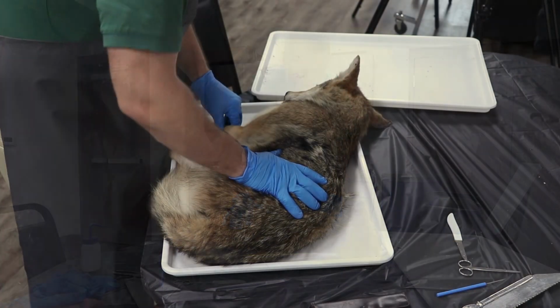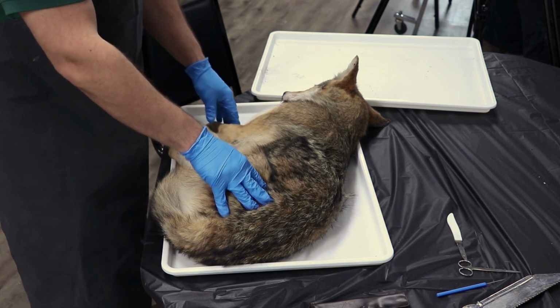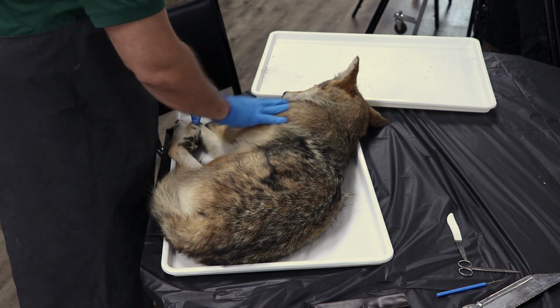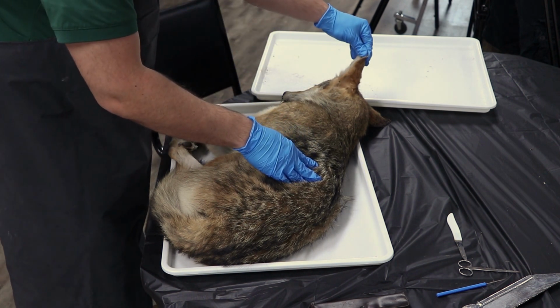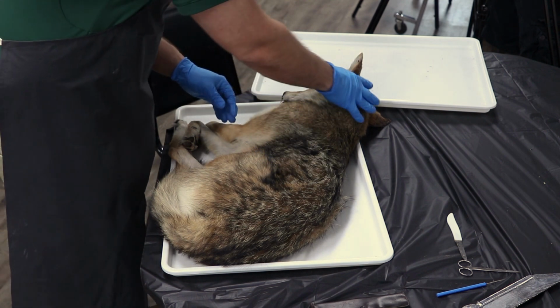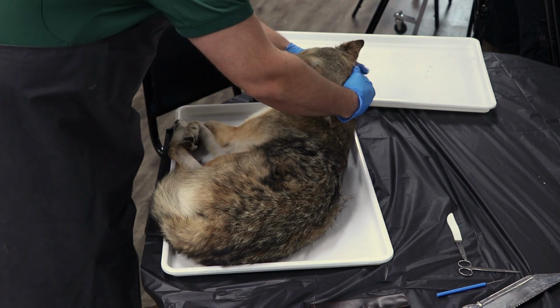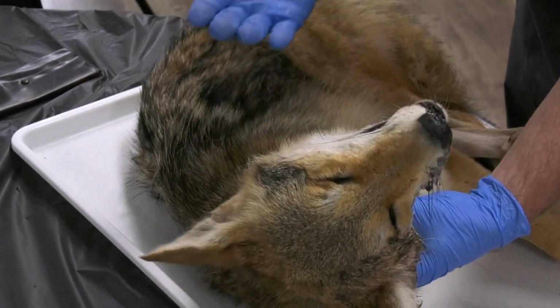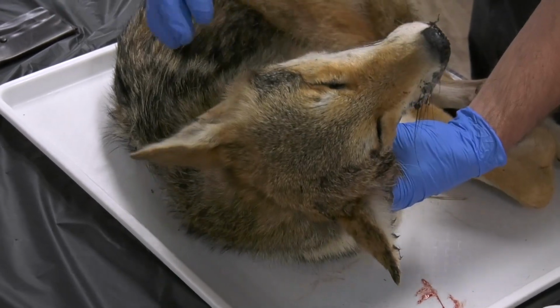So some external anatomy here. You'll notice that while it may superficially resemble a domestic dog, it's got a coat pattern that's pretty distinctive for the species. It's tawny underneath with darker tones up top. You've also got ears which are fully erect, which is unlike most of our domestic dog breeds. And you have a longer and pointier snout. And you can get a glimpse of that. Our domestic dogs usually have shortened snouts with curved lower jaws.